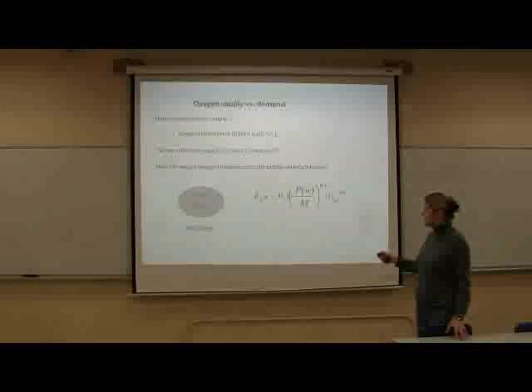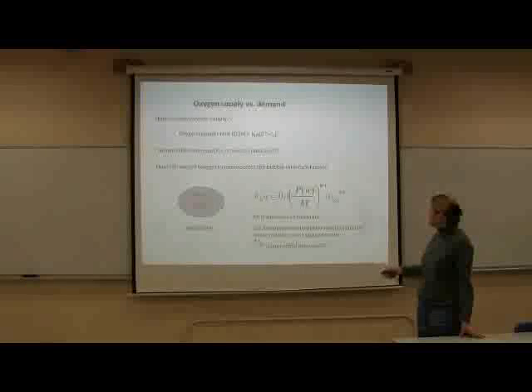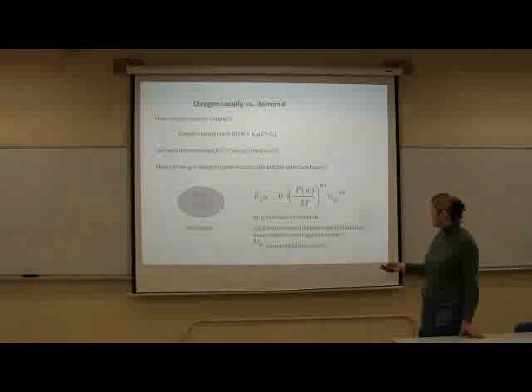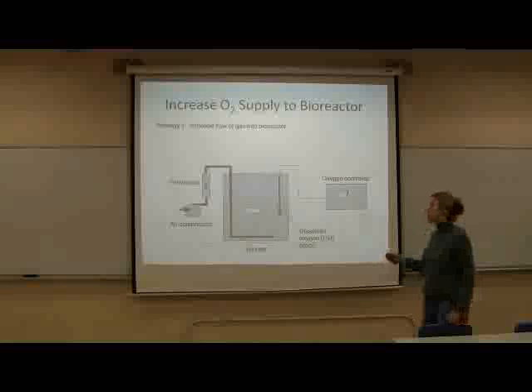You can measure the KLA though, using an online method, and I can show you how to do that. Okay, so point 1 is experimentally determined, and it should be determined for each culture problem. Okay, so let's talk about the oxygen supply to the bioreactor.